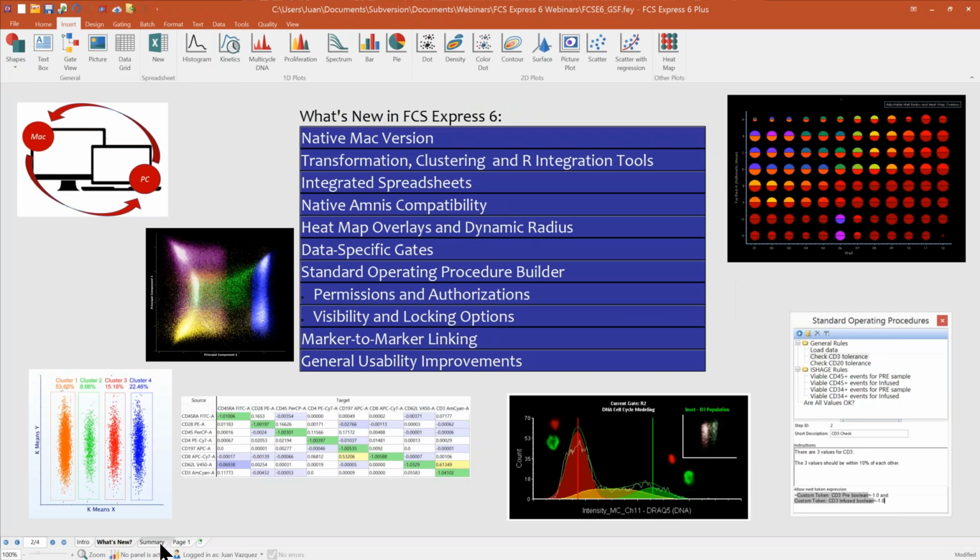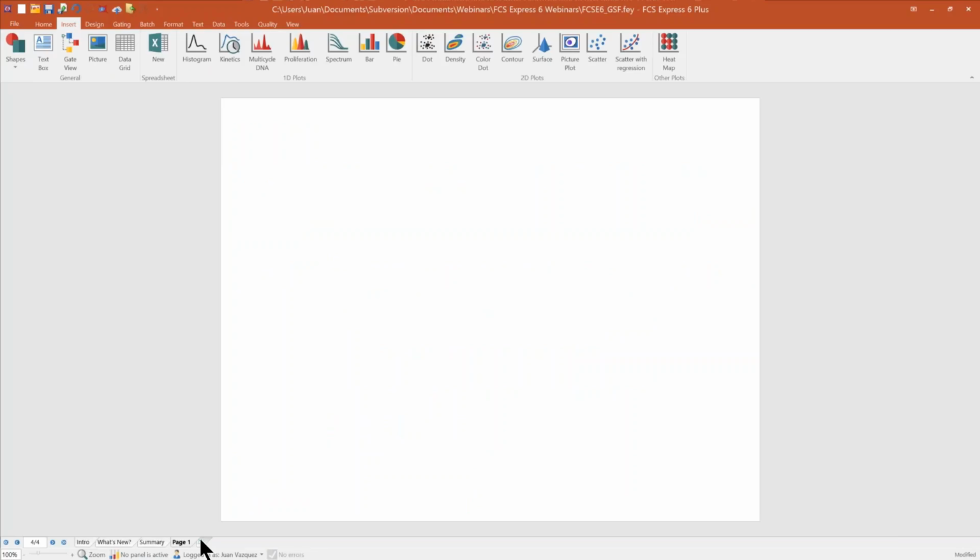is where we're going to be able to access all our pages. So adding a page is similar to adding a page in Excel, where you can simply just add a page just by clicking on the tab. Or if you want to just delete it, you can simply just right-click on it and delete it. And if you wanted to navigate between each of the pages, you can simply just click on the Page tab, or you can click on the arrows where you go to the very first, the very last, or any of the pages in between. Also, we can zoom in.